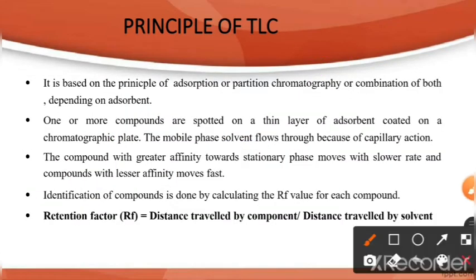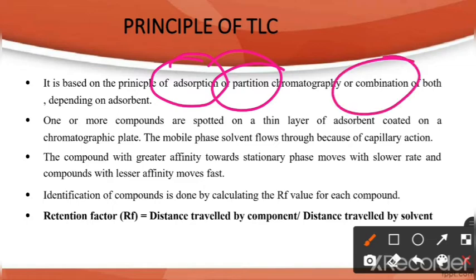Now, what is the principle of TLC? See, the principle of TLC totally depends on adsorption or partition chromatography or a combination of both. Now, let's see. We have one slide, and this slide is layered with a thin layer of silica. And at one end of the slide, around 1 centimeter from the end, we have kept one spot of the sample of interest. Then this sample will run slowly or fast, which totally depends on the adsorption or partition principle. That's what is known as the principle of TLC.